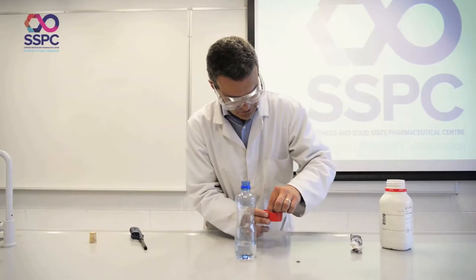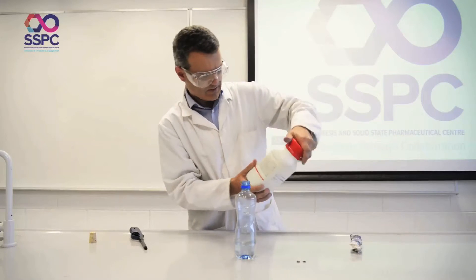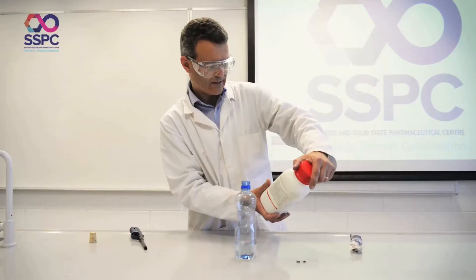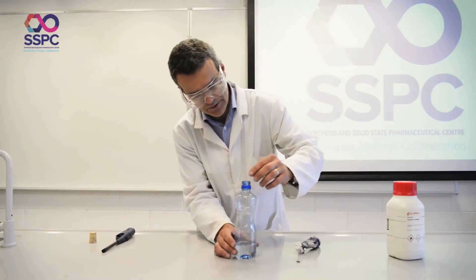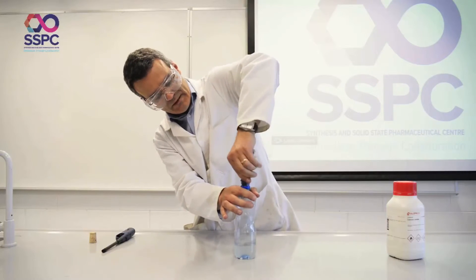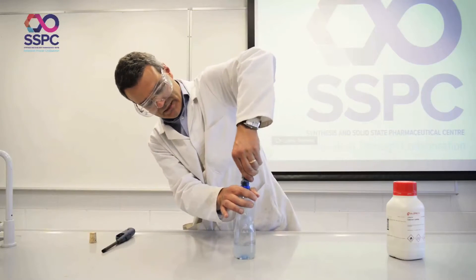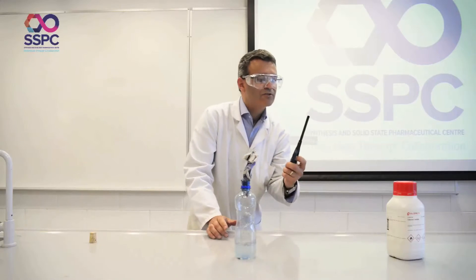I'll just put maybe two pellets in — that's plenty. There should be a little bit of bubbling there — that's the reaction of calcium carbide with water giving you acetylene. It's building up in the bottle, and the bottle is getting cloudy because calcium hydroxide is formed as well. Then you get it and just light it.